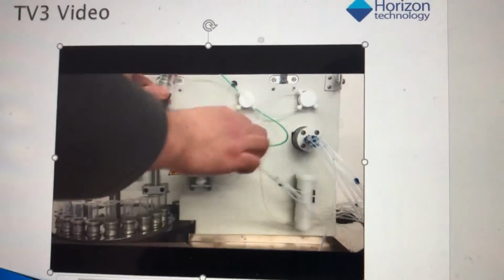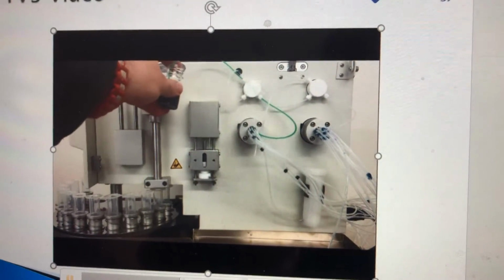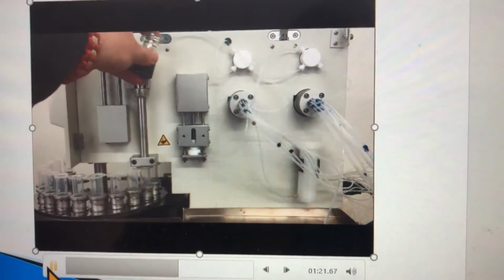I think that looks pretty good. So we've calculated the first one. In this case, it's 0.7. So we're going to have to write that number down. Send all the fluid back into the reservoir.